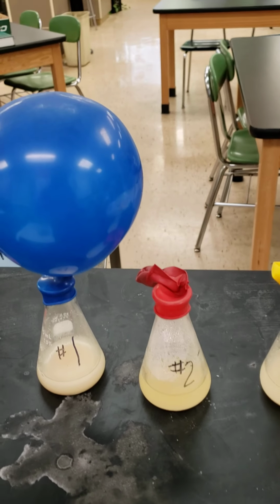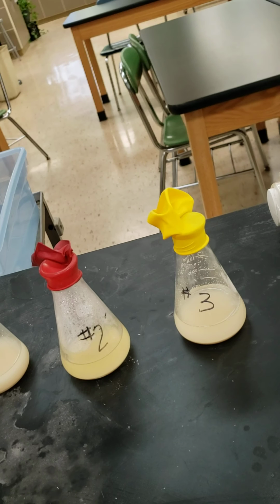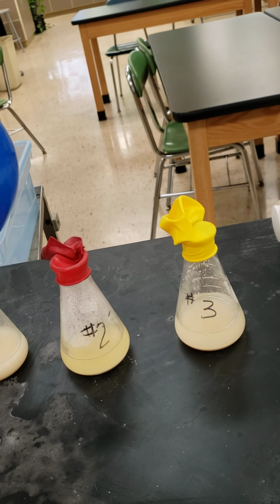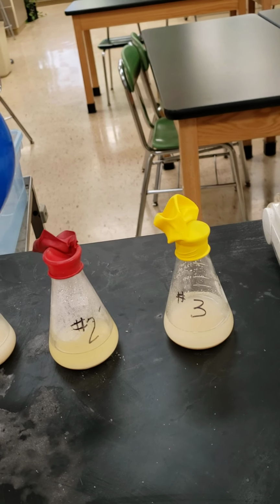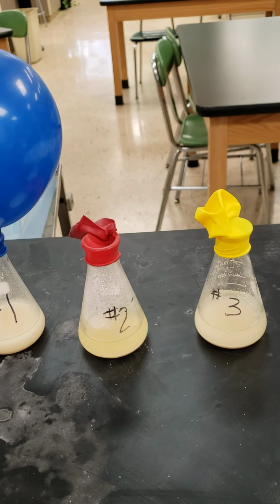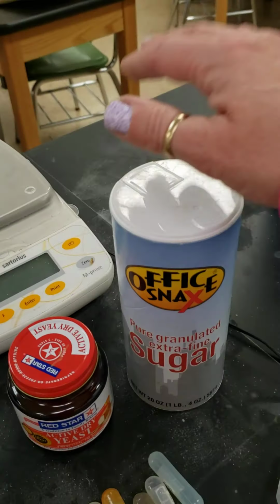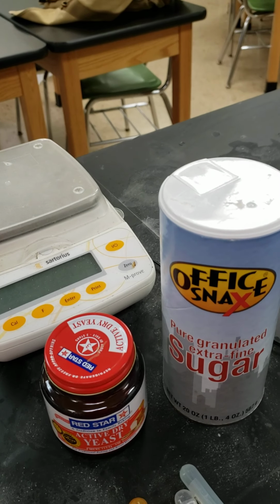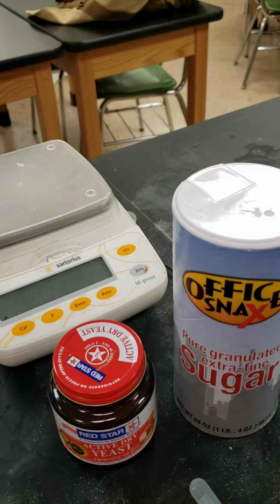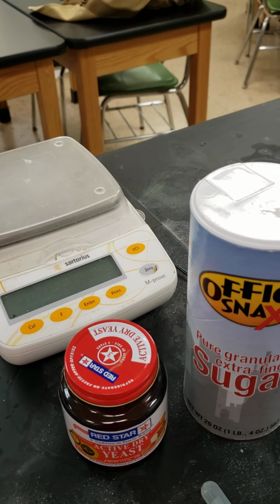And we used yeast, which is a single-celled organism that is living. If it's a living organism, it needs energy, so the yeast takes the sugar and uses that as its food source. Now, when you burn sugar, you release energy, and you also release carbon dioxide gas.